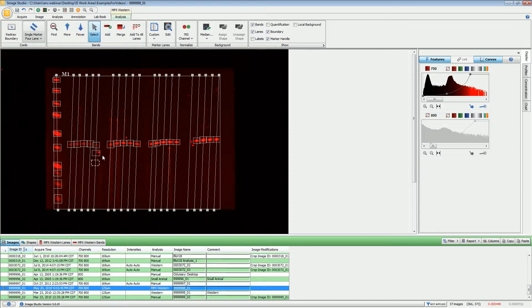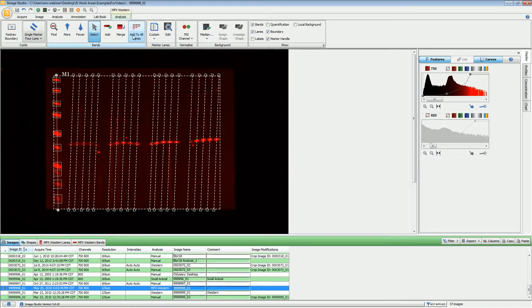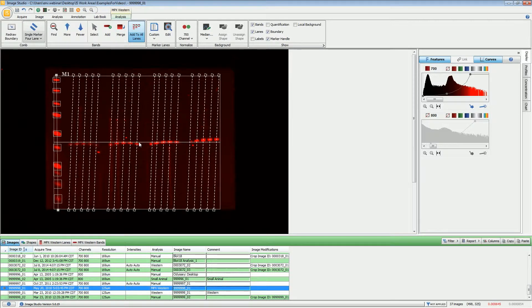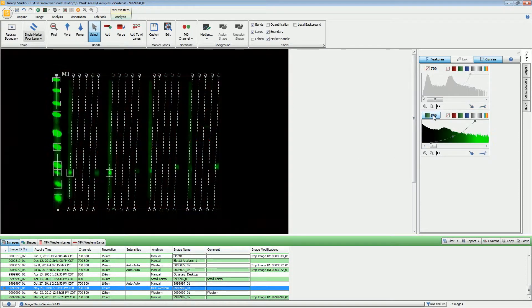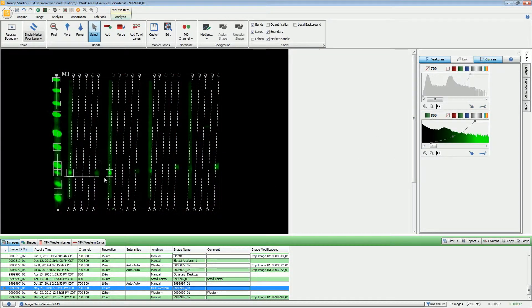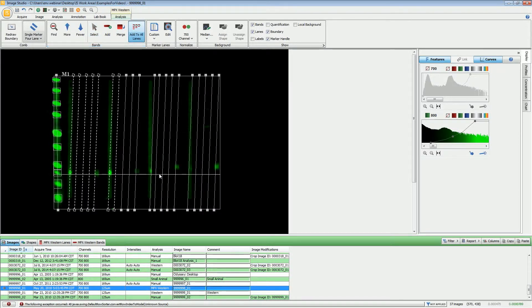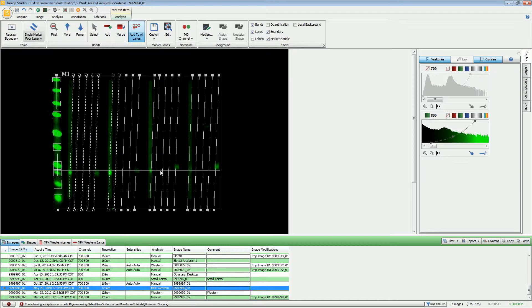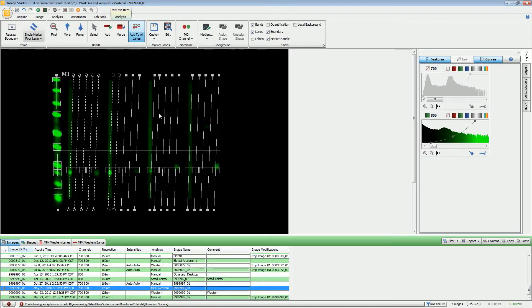You can also add individual band markers if you want to. You can add them manually just like that. Or if you want, you can use this add to all lanes and then it will draw that across all the bands on all of the lane lines. It will exclude the marker lane just to make things work easier. You can do the same thing in the 800 channel and make adjustments to the size as needed.